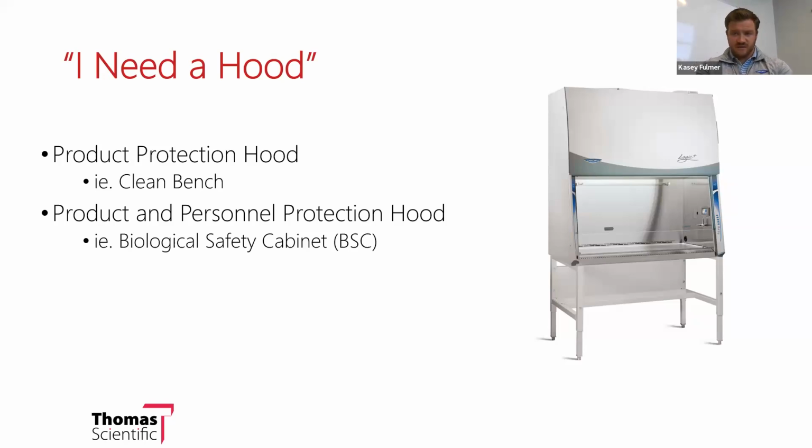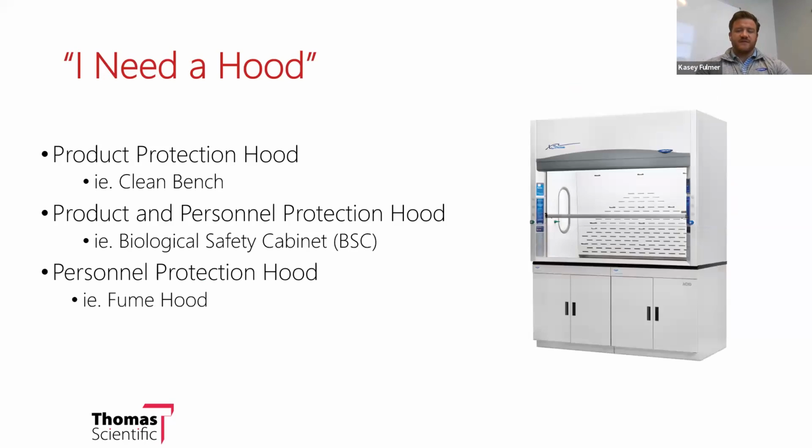And then we have what is typically referred to as a hood, a fume hood. And like I said, fume hoods offer personnel protection only, because all of the air that's coming into the hood is moving away from the user's breathing zone, and it's taking whatever's on the inside and exhausting it, making sure that the user never comes into contact with the vapors on the inside. You're not getting any kind of product protection, because whatever is in the atmosphere of the laboratory is now coming into contact with what's on the interior of that hood. So it's personnel protection only, and is the type of product that we're here to talk about today.